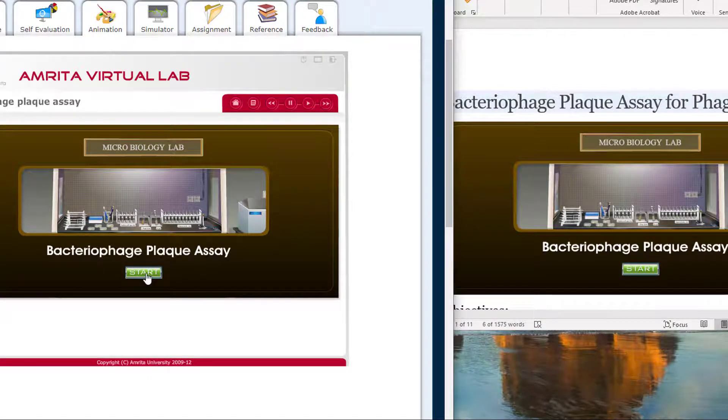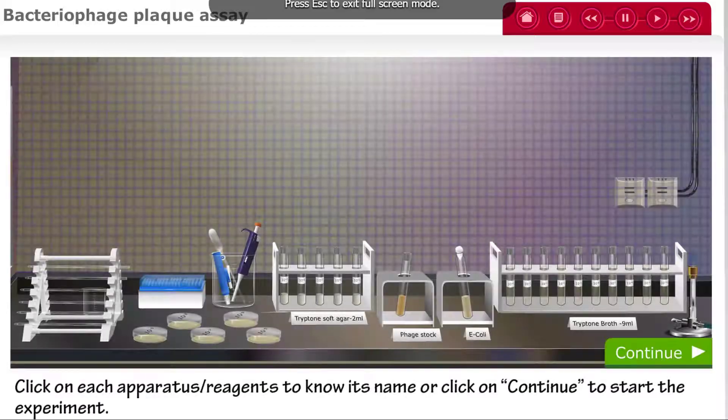Welcome to the Bacteriophage Plaque Assay Virtual Laboratory. Here is what you will need for your experiment.